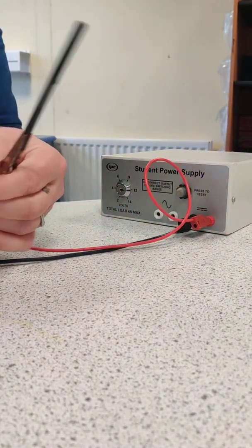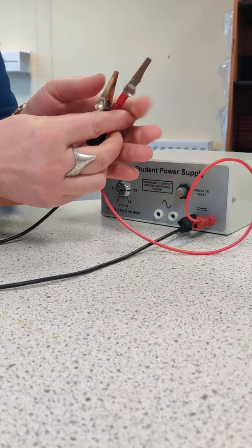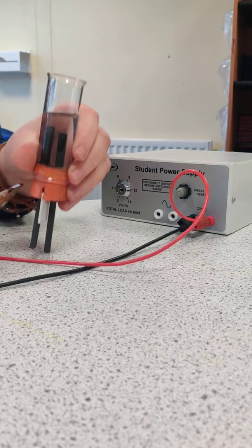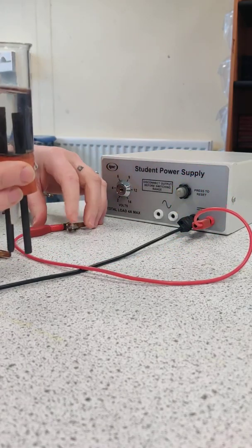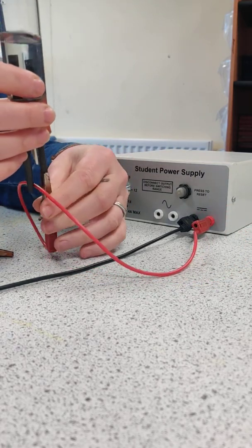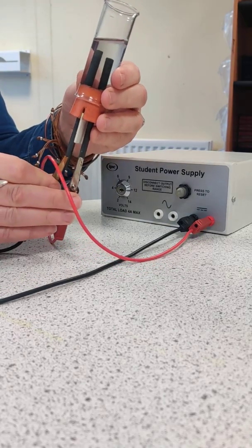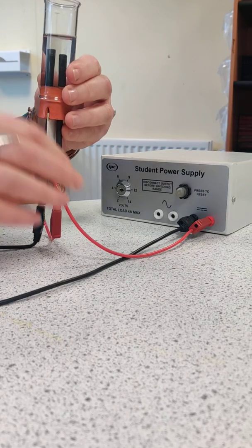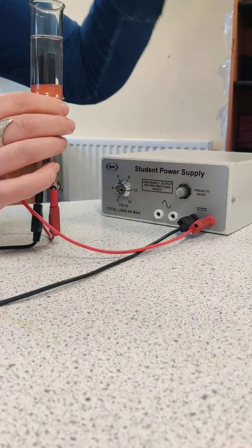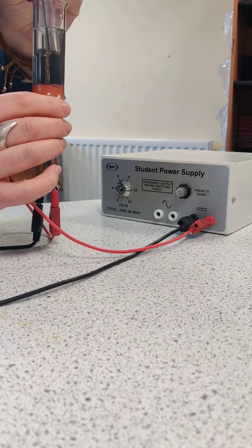If I wanted to prove that those were the gases being produced, I could use this, which is an electrolysis cell. The same idea — it's just a container with the solution in it, in this case water. I'm going to put crocodile clips onto the electrodes, and then pop over the top of the electrodes two little collection tubes that can collect the gases given off.